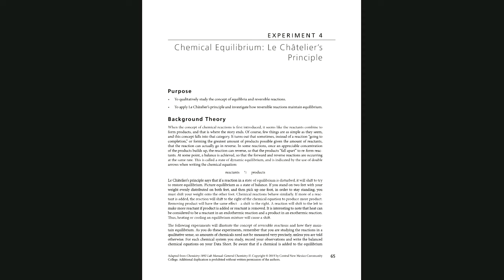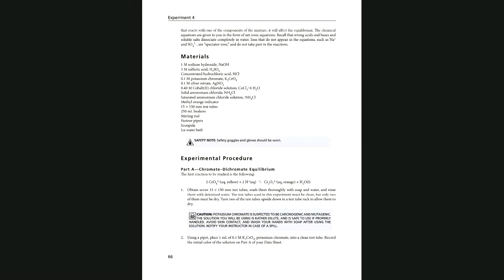I'm going to perform the experiment for you to collect the data. When you are recording your observation, please don't just say that the yellow color changed to orange color. Everybody, a kindergartner, would know the color change. But based on the color change, you should say if the reaction shifted to the right side or shifted to the left side. Let's say your reaction mixture is yellow, and then you add sulfuric acid, and it changes to orange. You can't just say the yellow color changed to orange color. Everyone would know that without being in 1046 class.